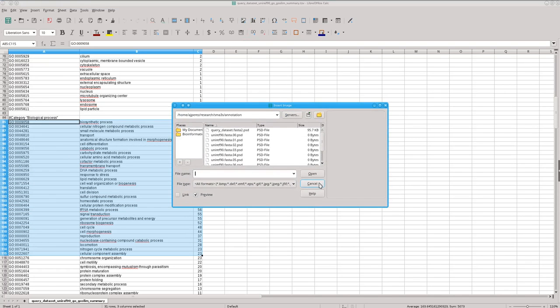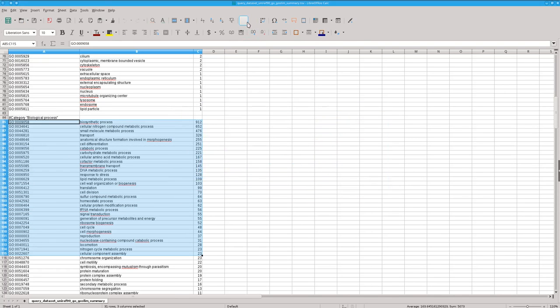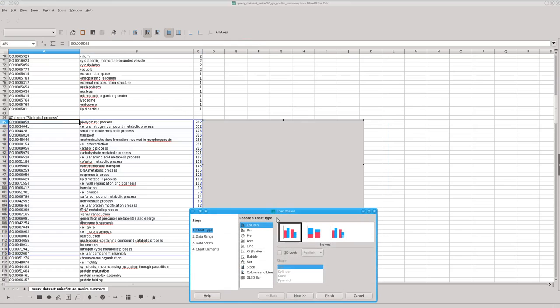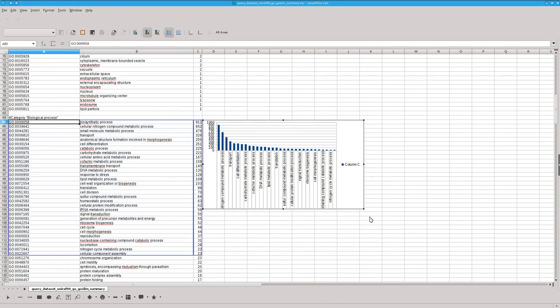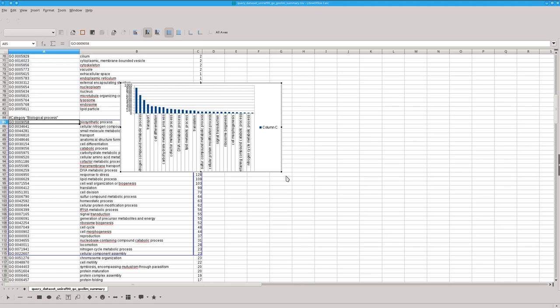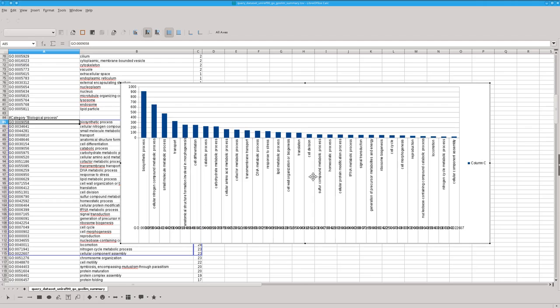This is an example with the number of proteins, in this case, belonging to the different categories, to the different biological processes.